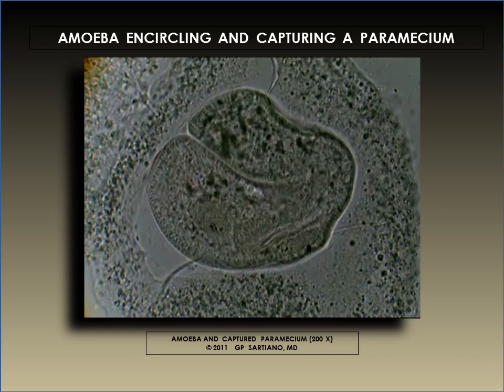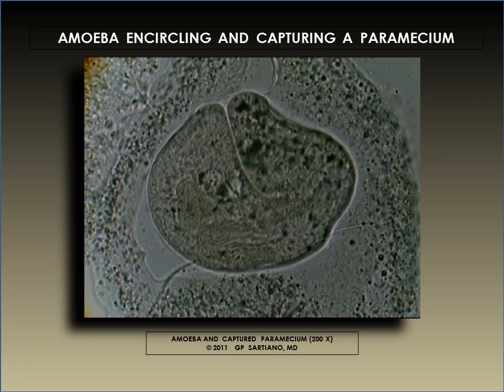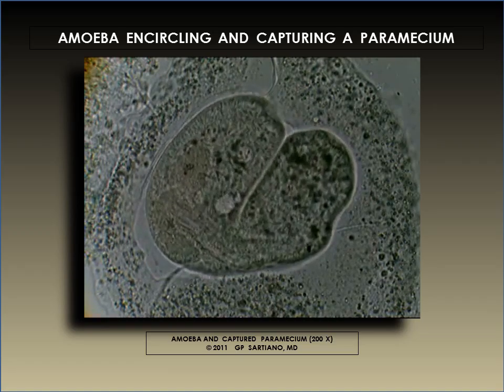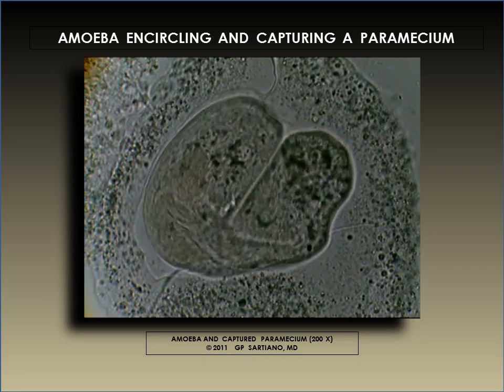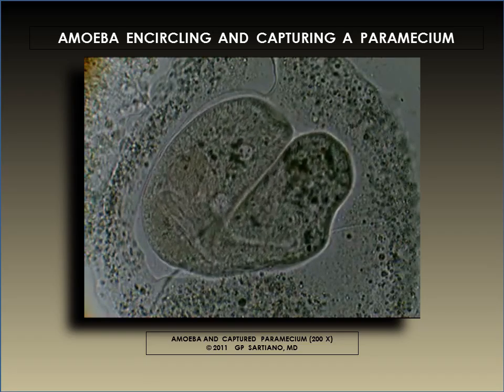It should also be noted that the trichocyst border of the paramecium is quite clearly visible and intact. There is no evidence whatsoever that the paramecium has discharged any of its trichocysts in defense against this life-threatening attack of the amoeba.